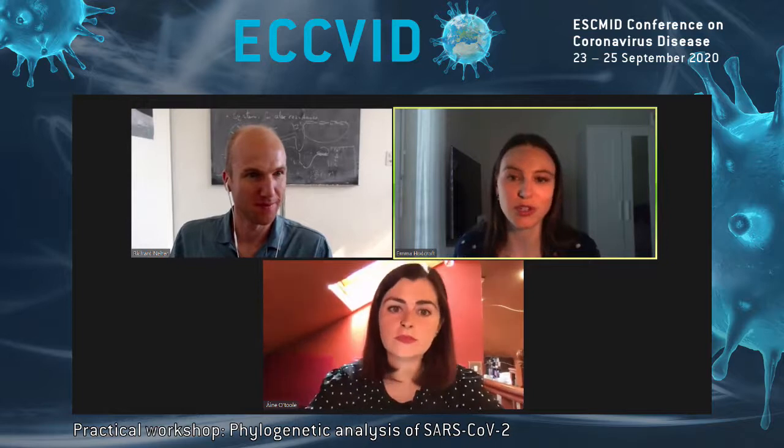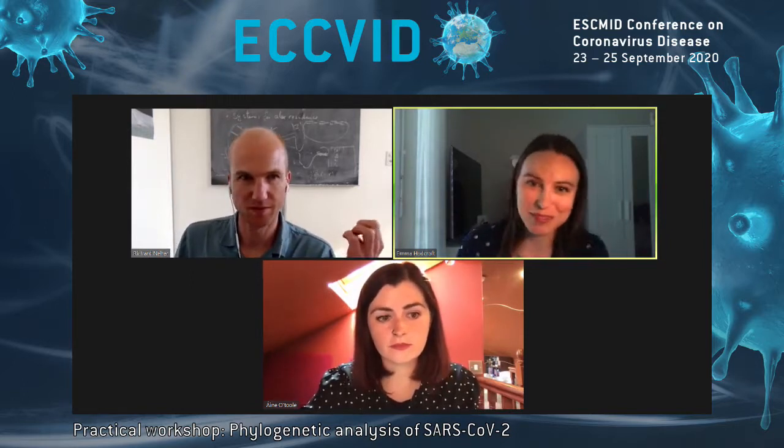So Rabindra asked a great question of whether we can just use the software for SARS-CoV-2 or not. The repo that I linked, the /ncov one, the novel coronavirus before it had an official name, is very SARS specific and assumes you're running SARS-CoV-2. But the NextStrain website and software in general is very flexible. And it was actually developed a long time before we knew SARS-CoV-2 was going to come to our humble planet.